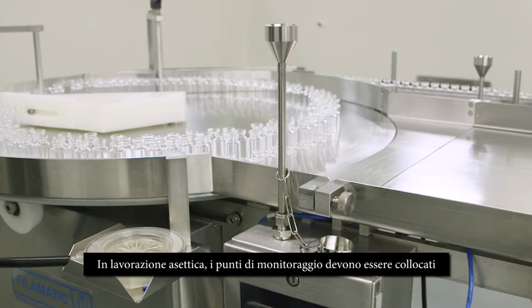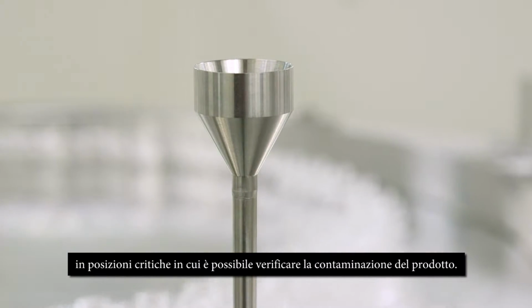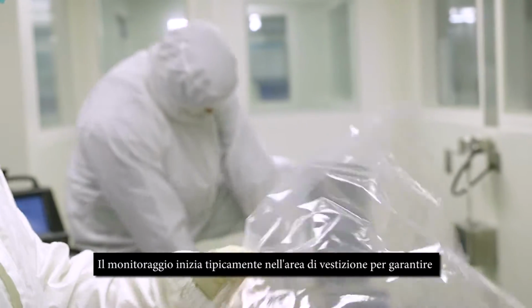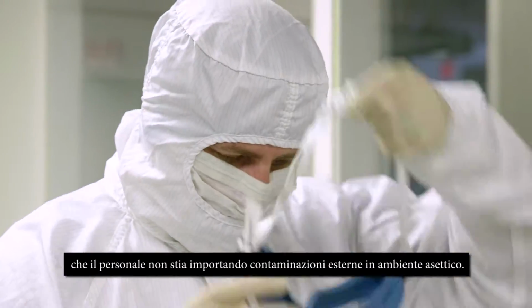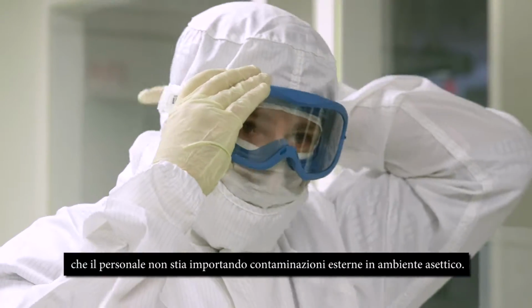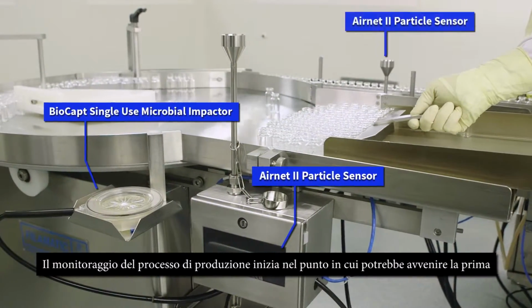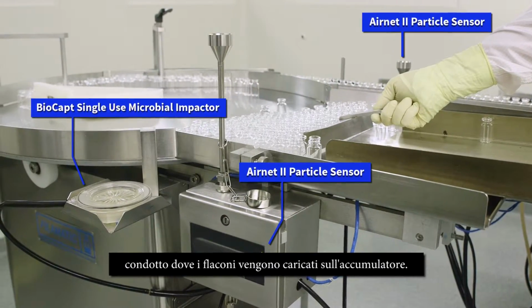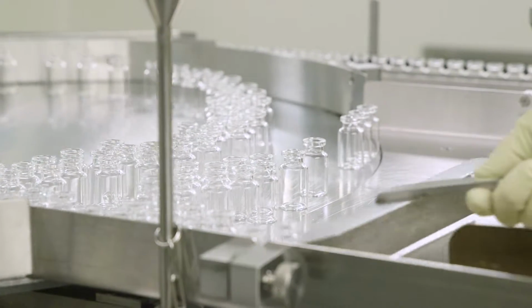In aseptic processing, monitoring points should be set at critical locations where product contamination may occur. Monitoring typically starts in the gowning area to assure personnel are not bringing outside contaminants into the aseptic environment. Monitoring of the manufacturing process begins where the first contamination may occur. Particle and microbial monitoring is conducted where the vials are loaded onto the accumulator.